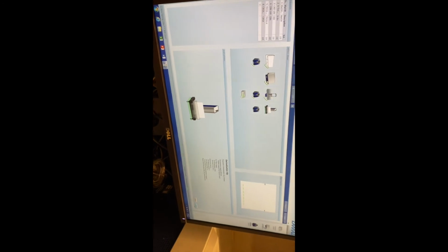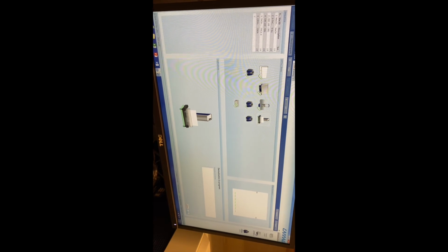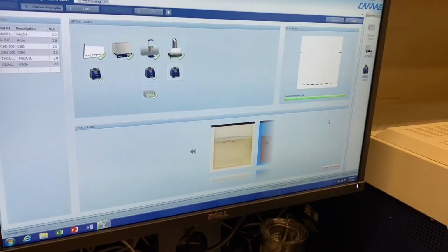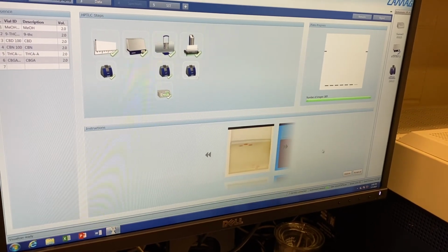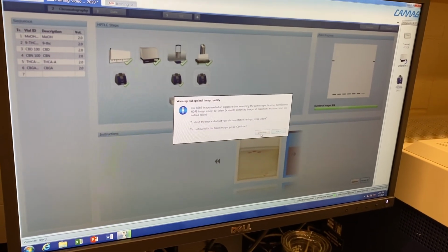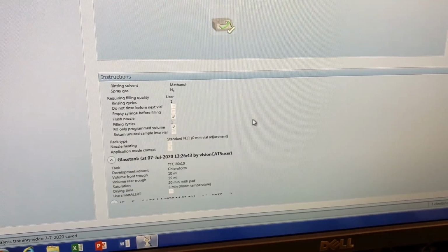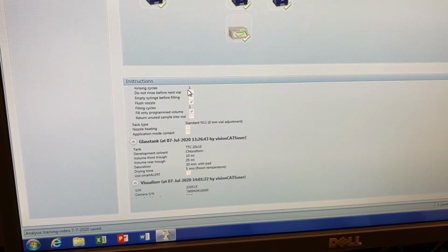Here, continue. Oh, we should have clicked continue before. So this step is already done. Okay, now visualizing it again. Continue, and then you will take pictures. Once the pictures were taken, make sure you're okay with them, and then you can click accept all. Then this window pops up. You click continue. And then the process is done. So those are the instructions. You can check if you're okay with them, and if you have forgotten to check any of those.